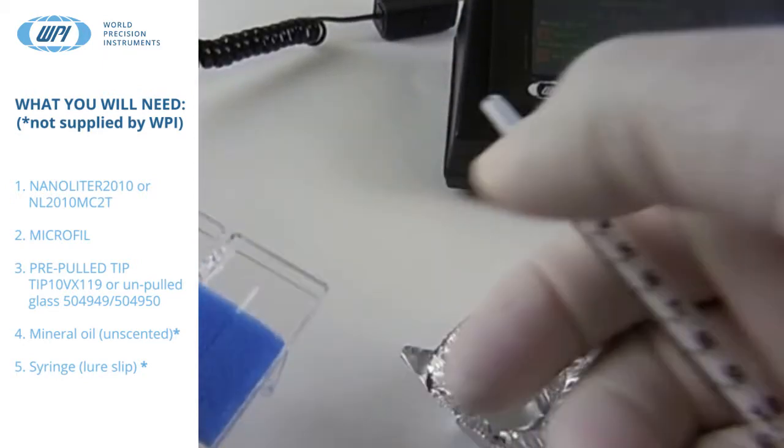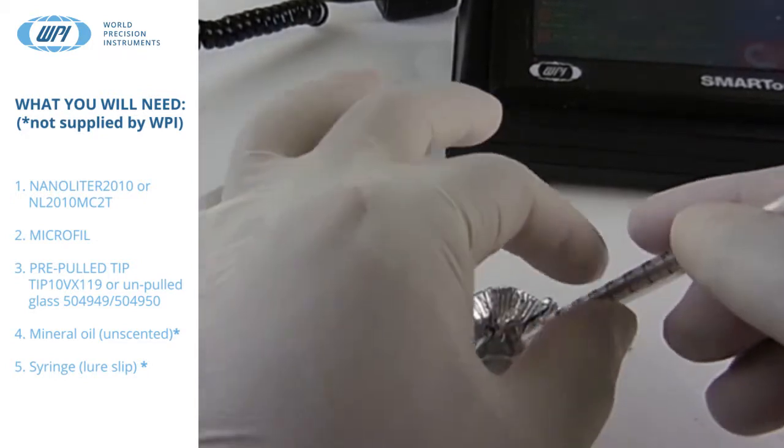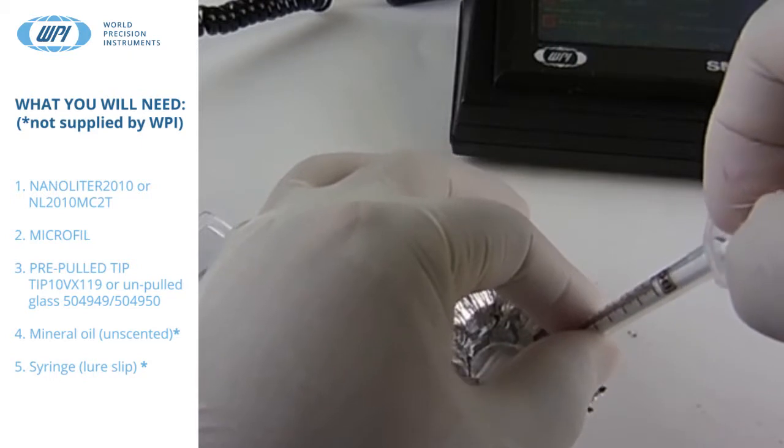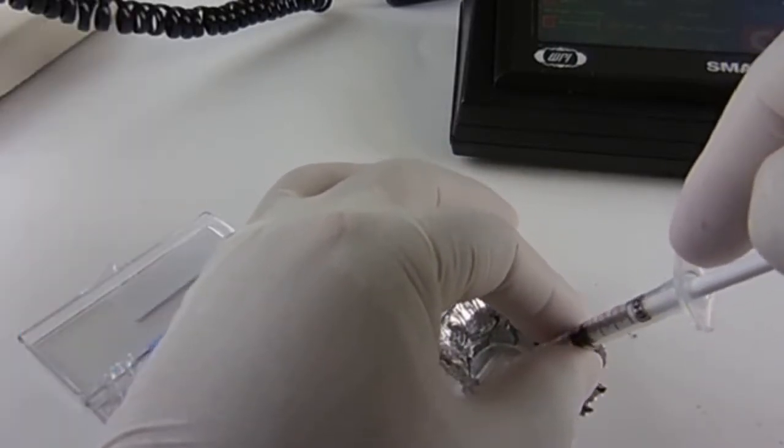WPI sells tips, or if you prefer you can buy the 3.5 or 7 inch glass to pull your own tips. The pre-pulled tips we sell is part number TIP10XV119.